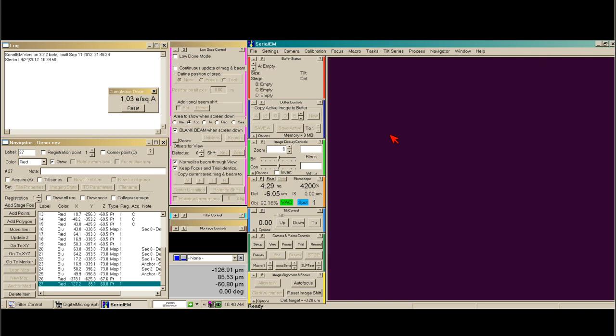I'm going to show you how to take a montage tilt series. I've already found my cell of interest and added its position in the navigator so I don't lose it. I've opened up the dose meter on the microscope control because I need to bake out the sample. I like to take it to about 1,500 to 2,000 electrons at fairly low mag. Because this is a montage, I really want to make sure the sample gets thoroughly baked, because you could end up with a lot of distortions between the different panels if you don't do this.